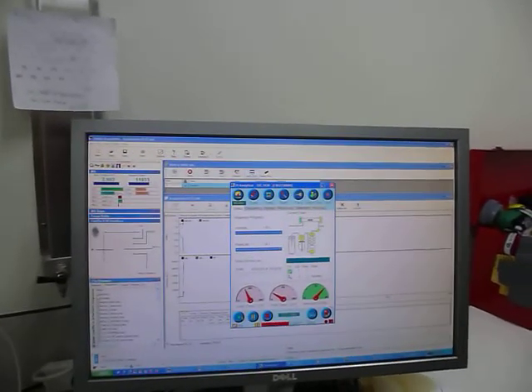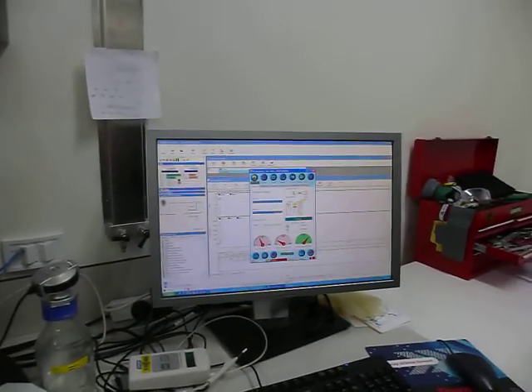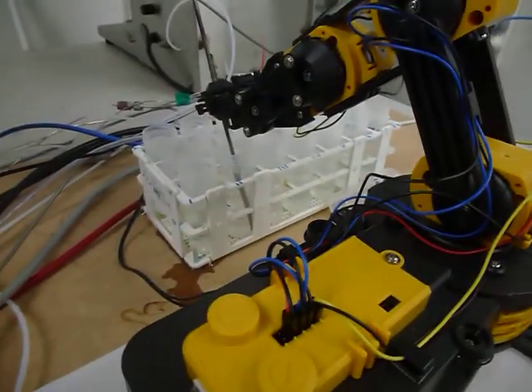So now it's waiting for a mouse click. This mouse click will be given automatically by the script. So it already did. So now the Aurora will move again. This time it's priming the sample, so it's taking some water from the vial there.